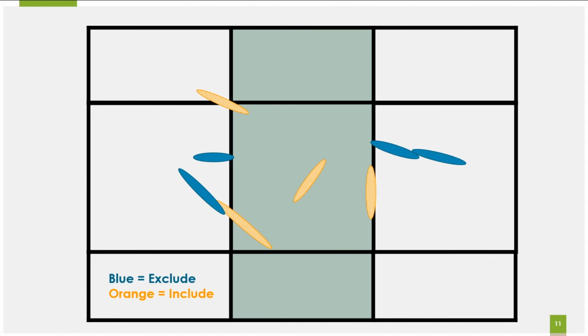And by using those comparisons, we can tell you if you're within 100 cells, you're good. I think early on, both Brooke and Eric were freaking out because, oh my God, I got 1,000. Right. I only got 800. We're like, we don't even know if that's good or bad. Yeah. What does that mean? So as we get into this, if we want, we can sort of share that.